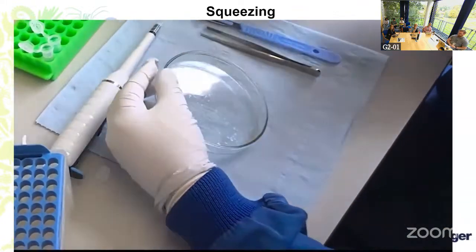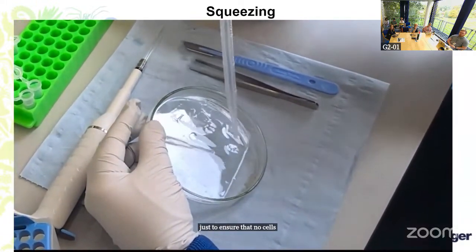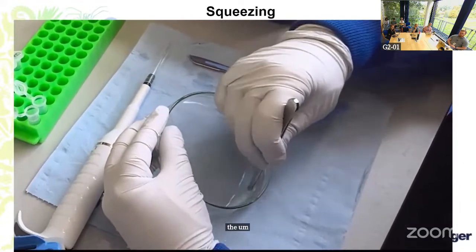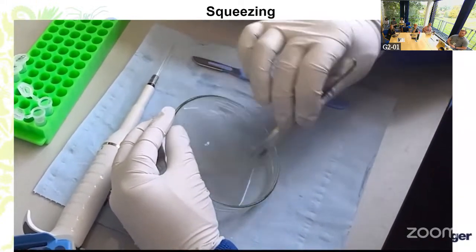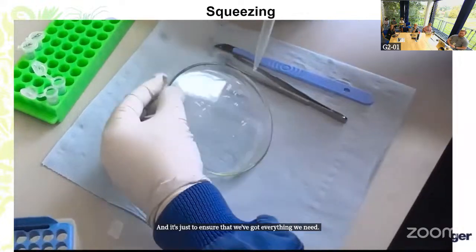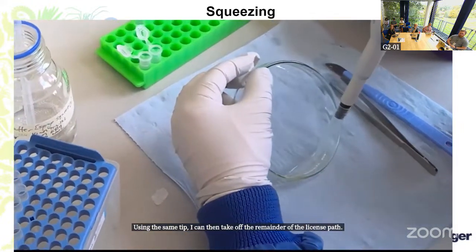Once this has been done, a second round of shorter squeezing is done, just to ensure that no cells remain in the Petri dish, and that we've captured all of the lysis buffer that we can. This second stage is much faster and is just to ensure that we've got everything we need. Using the same tip, I can then take off the remainder of the lysis buffer, filling up my tubes.